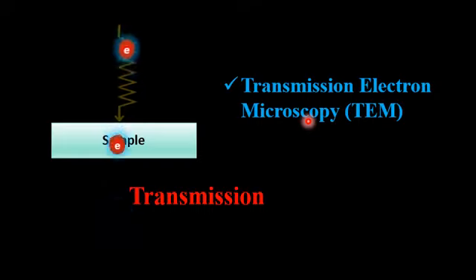This variation of energy gives you information about the structure, composition, as well as orientation of the material.